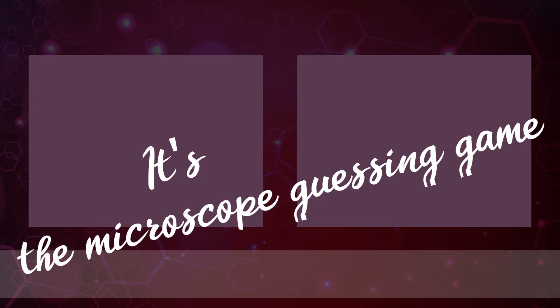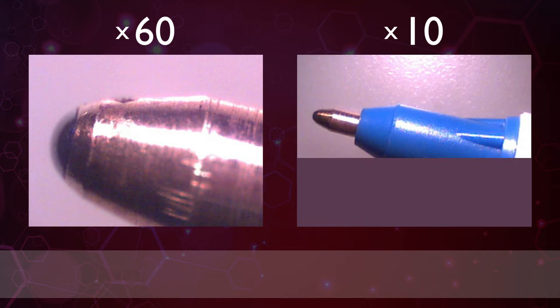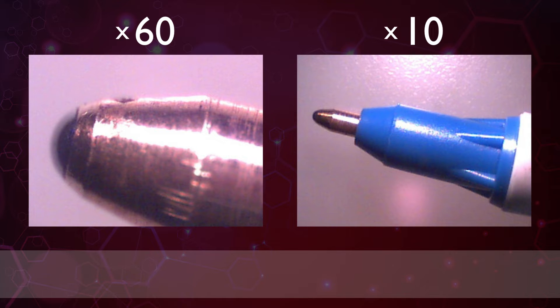Hi folks and welcome to another edition of the microscope guessing game. If you've seen the last video then you'll know the format. I'll show you one image at 60 times magnification and you have to guess what it is. All objects can be found in the home. You'll then see the object at 10 times magnification which should make it easier to identify.